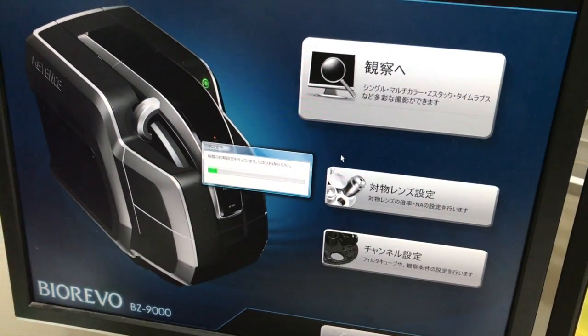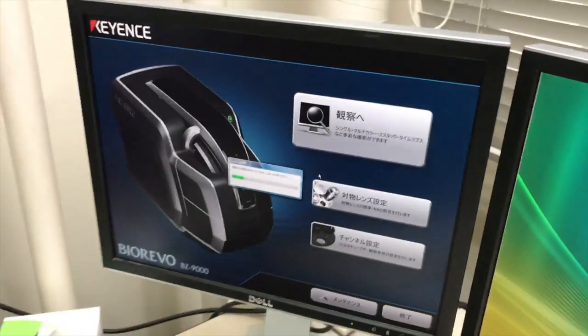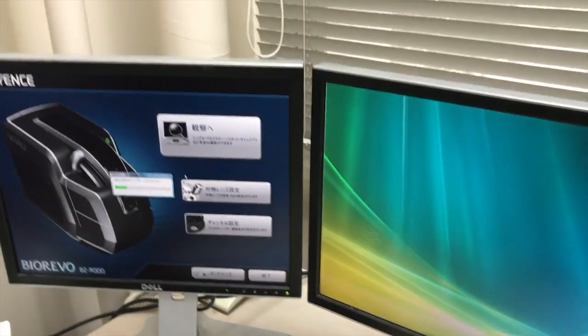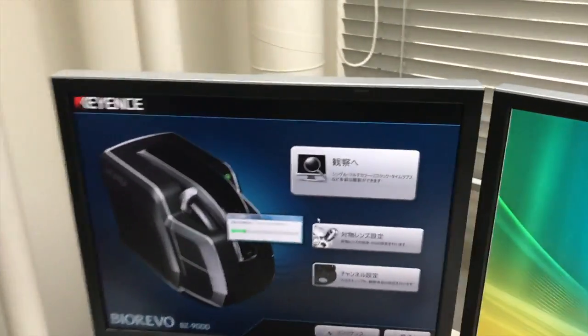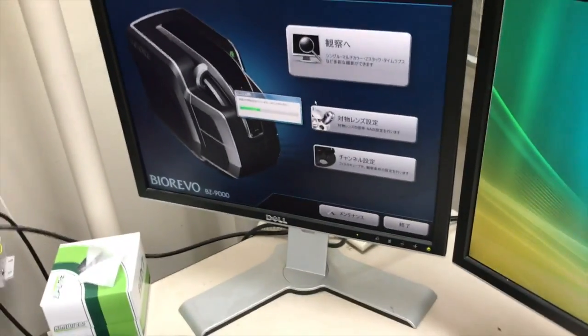The software is all in Japanese only. It's all available. So we cannot change the language here? No, no, no.